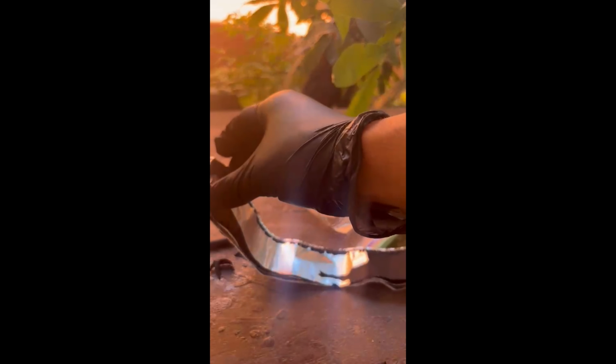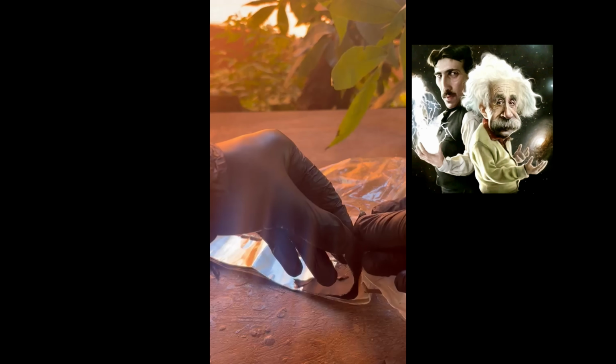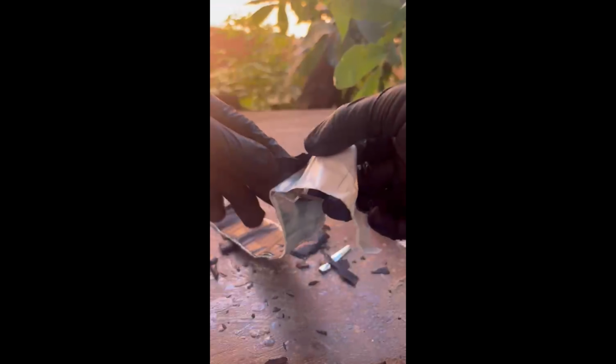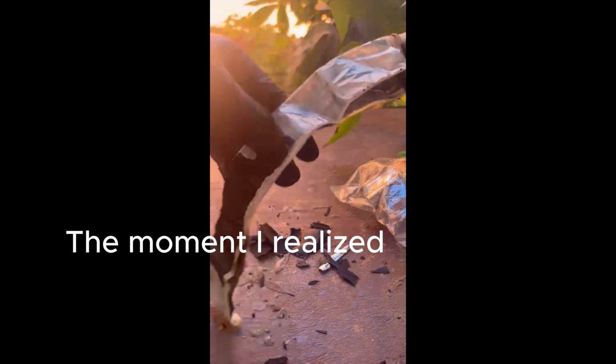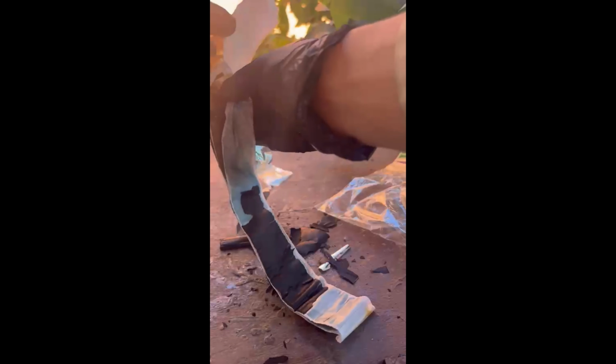I have to say I made a pretty dumb mistake here because I thought for a moment the metal-like foil was the lithium metal foil and that the black foil got impregnated to it, so I started removing it with my hands. This, of course, was pretty moronic of mine because in case of happening, things would start to just heat up. When I eventually realized it wasn't the lithium metal foil, I realized it already started to heat up, so I hurried and took the wrong foil out of the pack and stored in there the correct one.